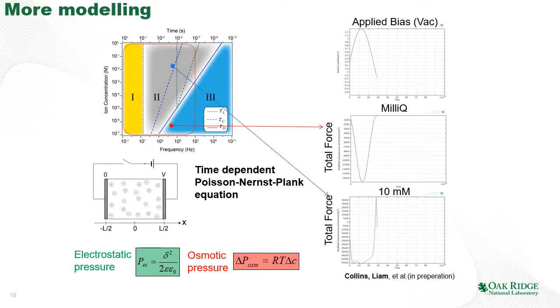So what happens if we model the electrostatic forces in this regime? Turns out that we can take this model and calculate the excess osmotic pressure, which gives us the tip-surface forces. And one thing that you can notice is that the forces become very complicated. So for example, if we operate in this regime, which is relatively high ion concentrations, you can see that the dependence of the force on the bias is very nonlinear. So it is a very complicated phenomenon.